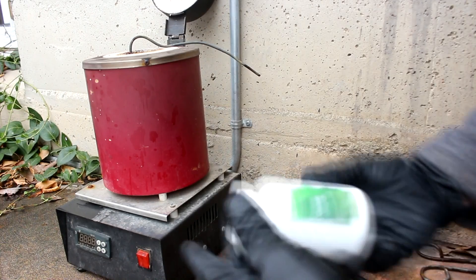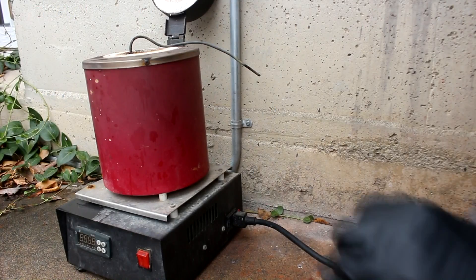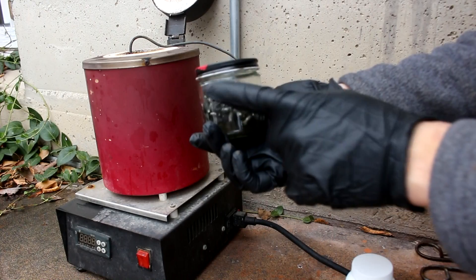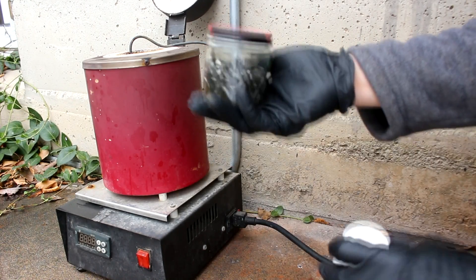First, I'm going to be using cesium chloride, which I've purchased rather cheaply online. And second, instead of sodium metal as my reducing agent, I'm going to be using lithium metal. The vapor pressure of molten lithium is lower than sodium, so my product should be more pure.